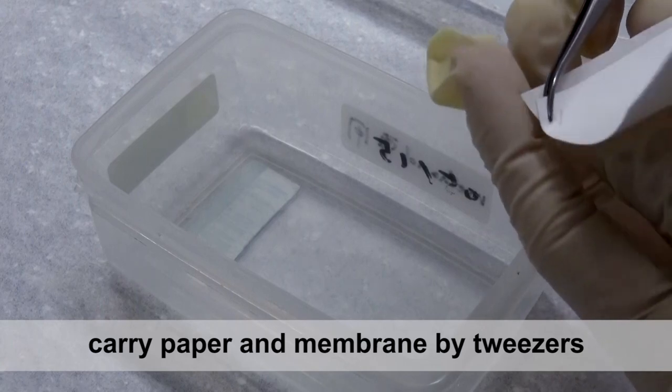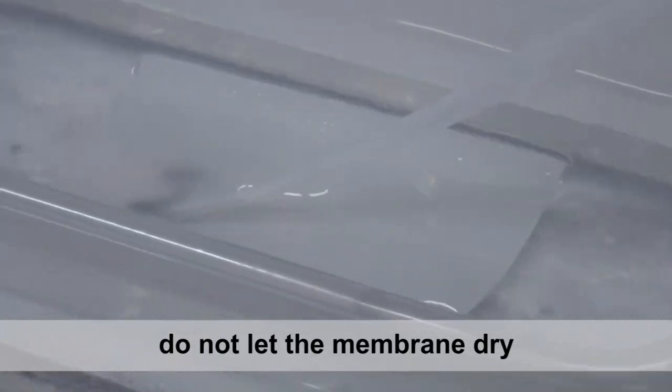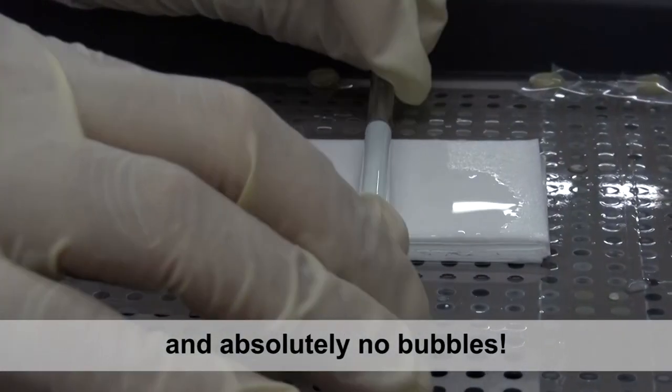Wear gloves. Carry paper and membrane by tweezers. Do not let the membrane dry. Ensure absolutely no bubbles.